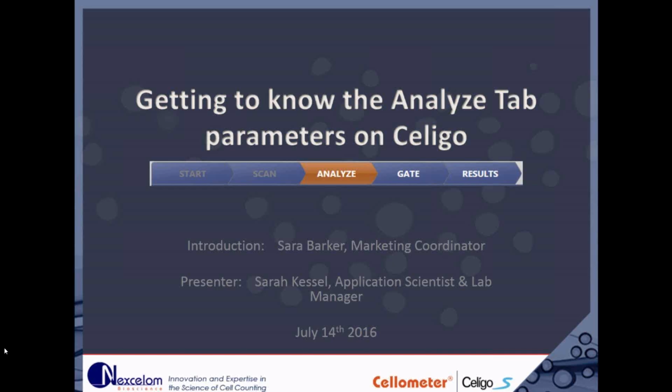And today she's put together some content on getting to know the Analyze tab parameters on the Celigo. And I want to thank our audience because this is actually a recommendation for a topic that came from past attendees: how do all of these things work. So this is going to be, I think, a great presentation. I'm actually looking really forward to this content as well.